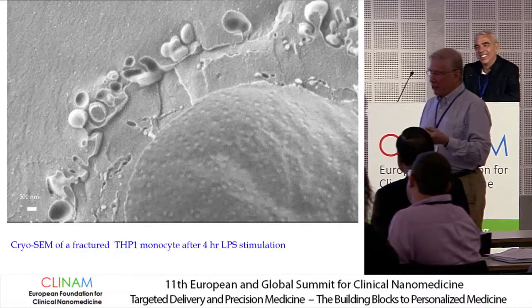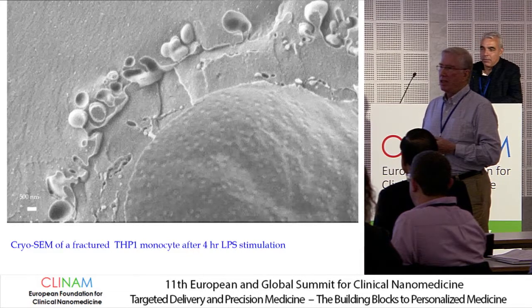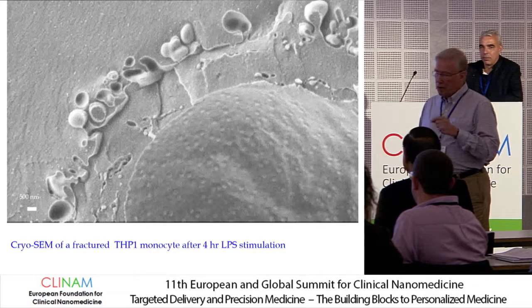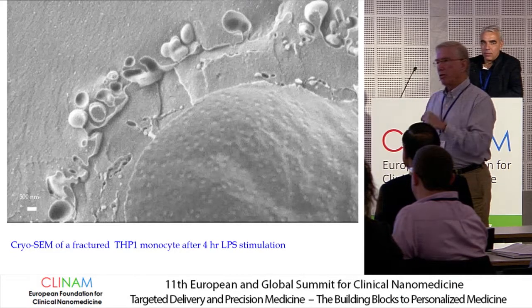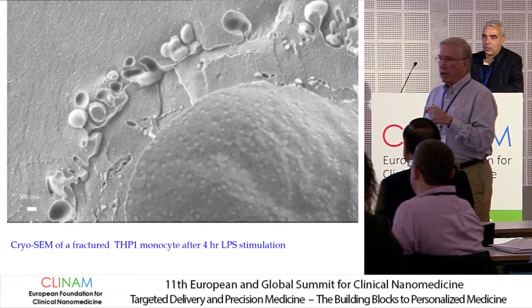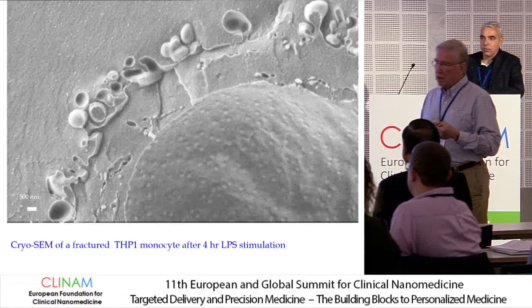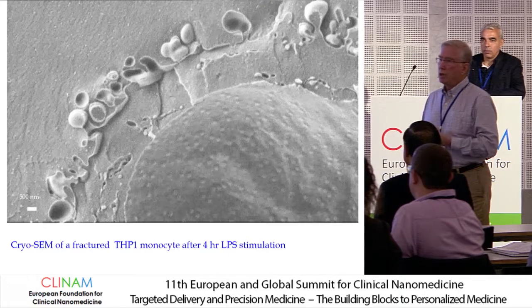This is a very valid argument to criticize electron microscopy, and in some cases, if it's only a pretty picture, that is not enough. However, when it's a pretty picture that actually describes correctly what you have in your specimen, that's a different issue. We are still not there, but you can start quantifying it by image analysis methodologies. So this definitely can be done. In principle, there shouldn't be a problem doing it.